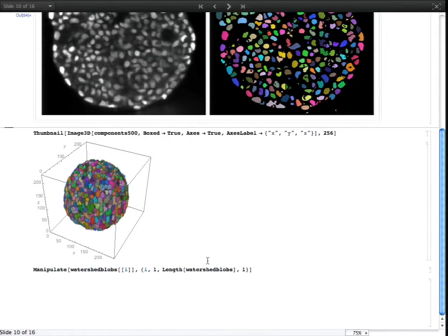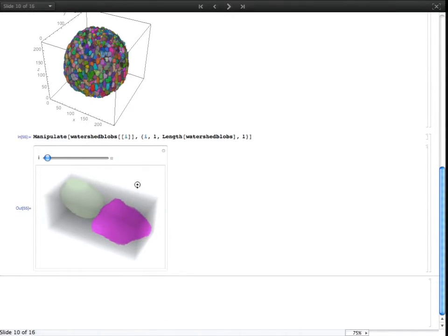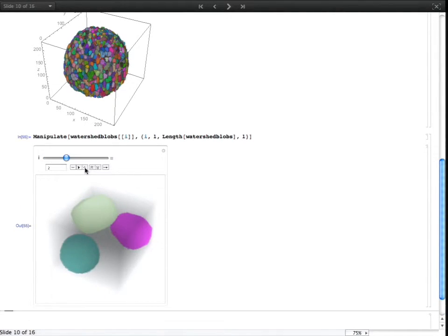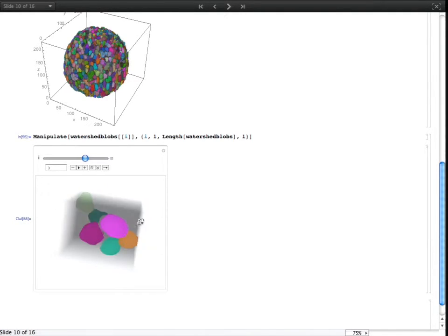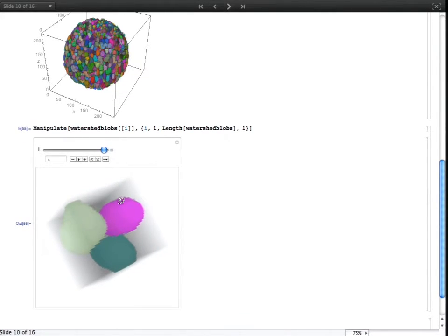And just to visualize it a bit more, I'm going to show you my examples from earlier. So these were the ones, they were all combined together, and now we have 2 nuclei here. This one's also nicely separated. Here we have our big cluster, again, that worked rather well. And there we have the 4th example. So there you can also see you spread out from here, and then this is where the 2 water basins sort of meet, and this is where you get the separation.